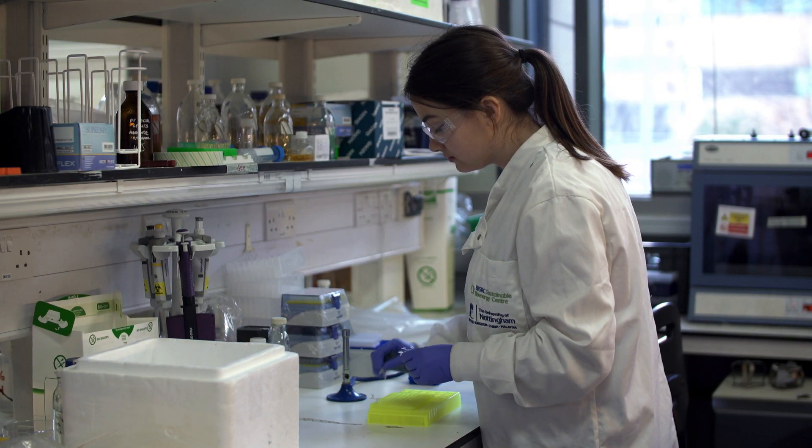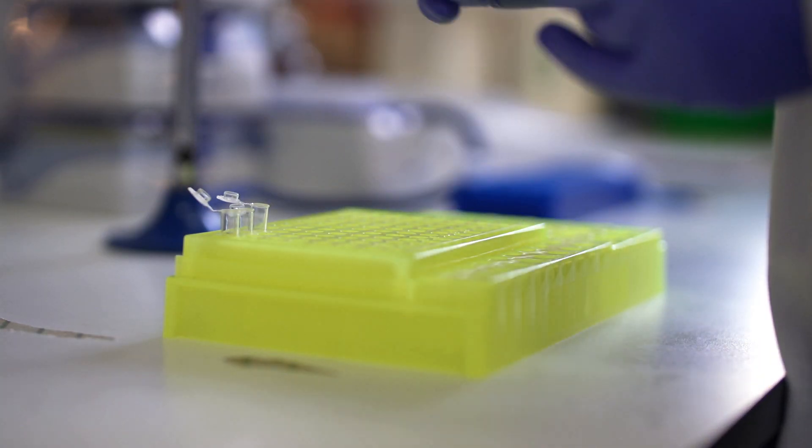Our lab work involved a lot of cloning including PCR. In microbiology, PCR is a routine process that we use.